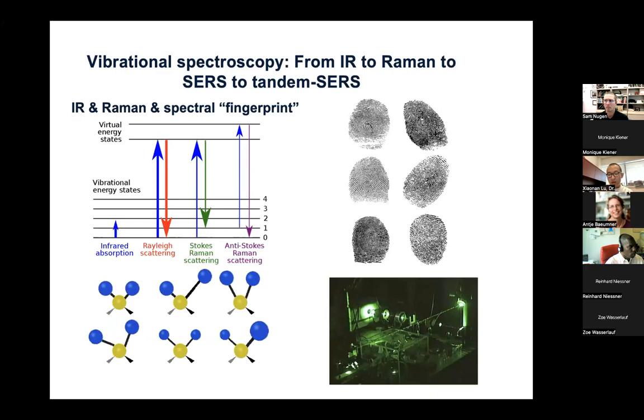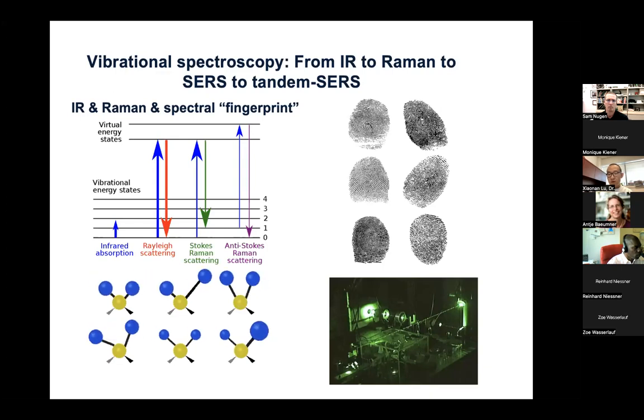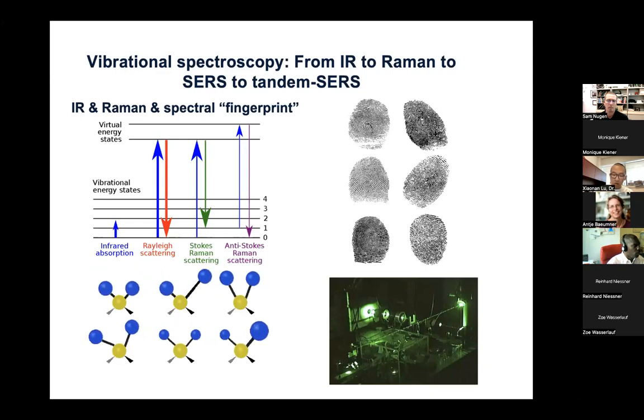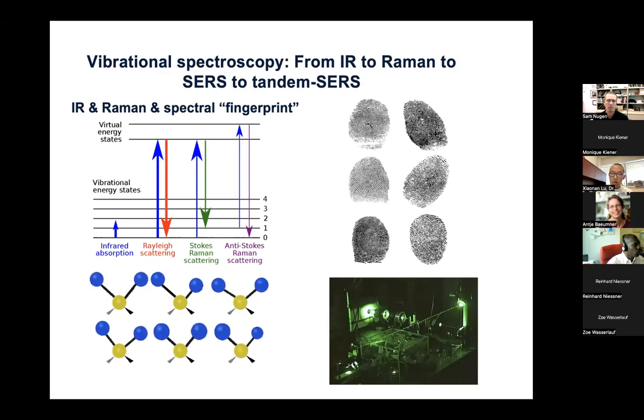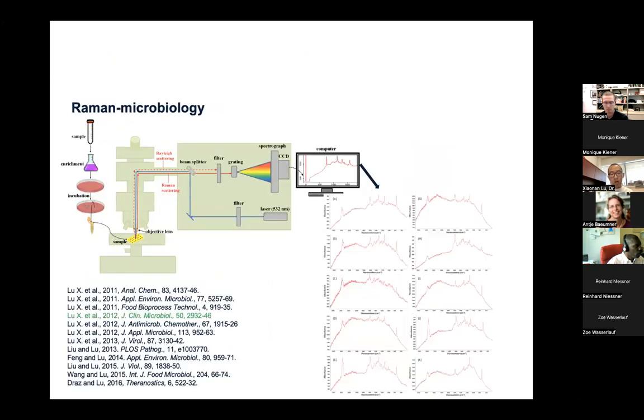This is a confocal Raman spectroscopy system that we used before. The laser, as you can see here, is a green laser. The wavelength is 532 nanometer. So this gives you a general idea that you need to work in a dark room for all the Raman spectral collection. It was about 10 years ago that we started to work on using Raman for a lot of different microbiology studies. This gives you a general idea how you can use a confocal Raman system for the characterization of bacteria.